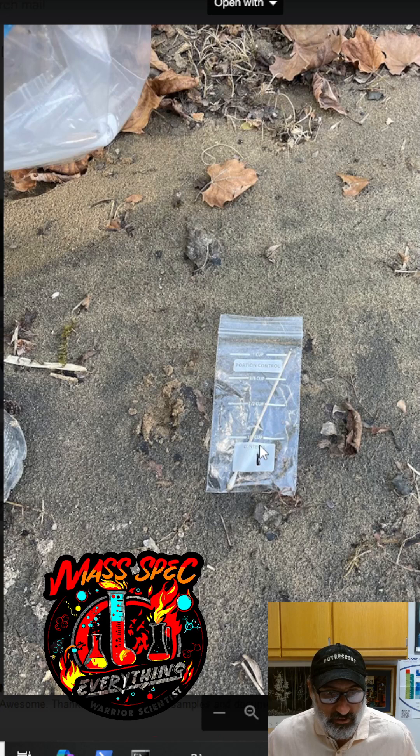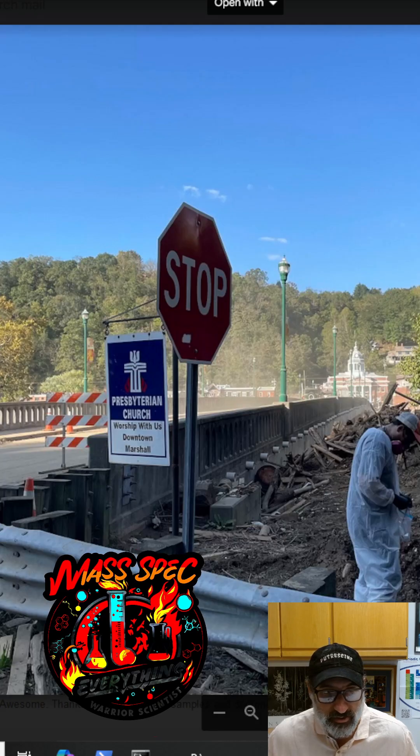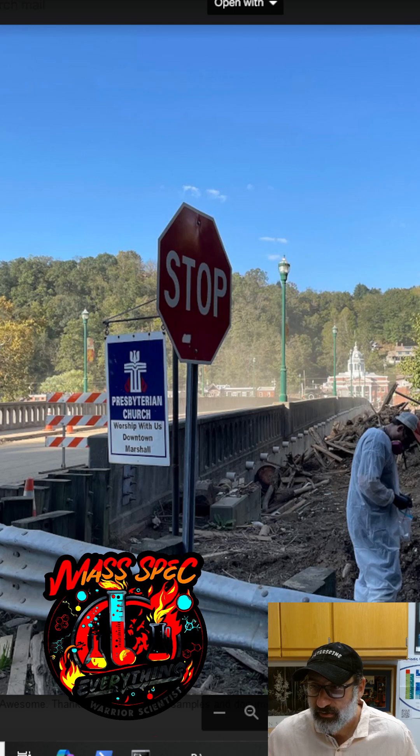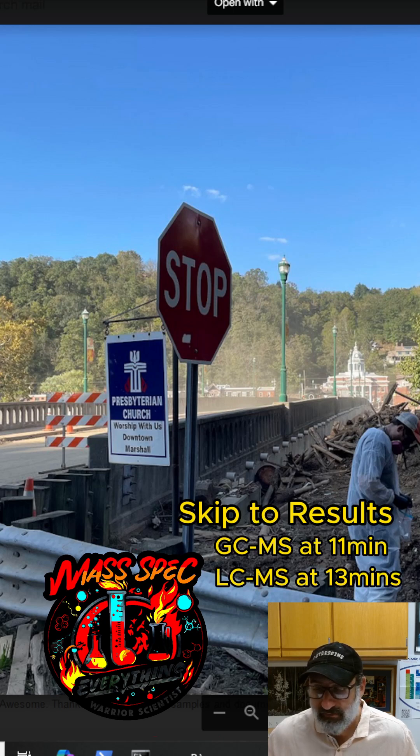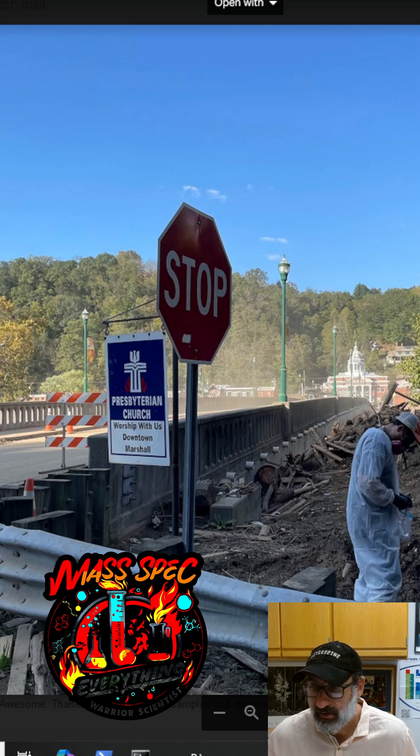This is what the sample looks like. Hopefully there's a bunch of dirt inside the Ziploc bag. Look at these poor people. I have family from North Carolina in the affected area, so I'm personally really invested in this. We have a cabin property three miles, four miles over the border from Tennessee on that 321 road, Tennessee towards North Carolina. It's definitely a tragic thing for the region.